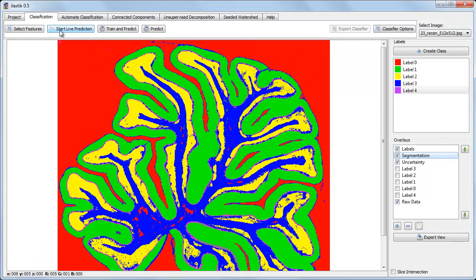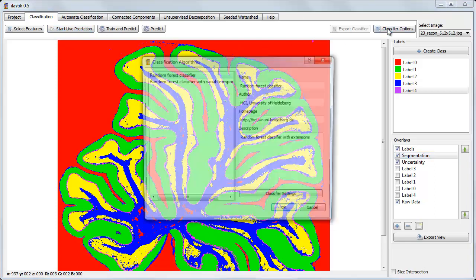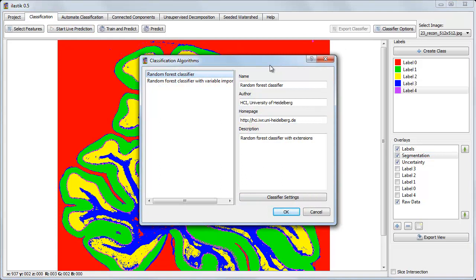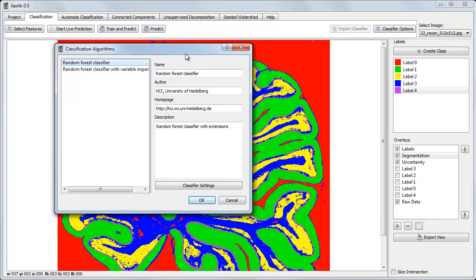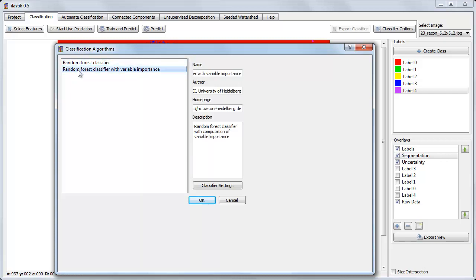Now we've trained our classifier on the labeled data, and we can see what it predicts for the remaining pixels. The classifier that we're using here is called a random forest. We can see the classifiers that are available by clicking on the classifier options button. And we can see that Elastic has two classifiers available: the random forest and a random forest with variable importance. We'll not cover this variable importance version in this video. That's a subject for a more advanced video.